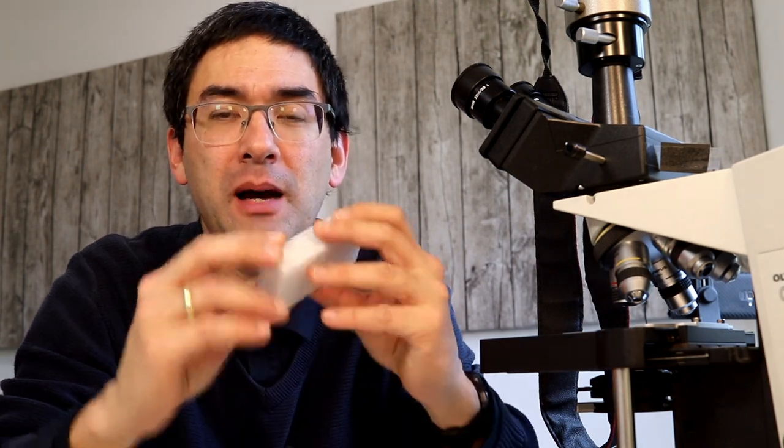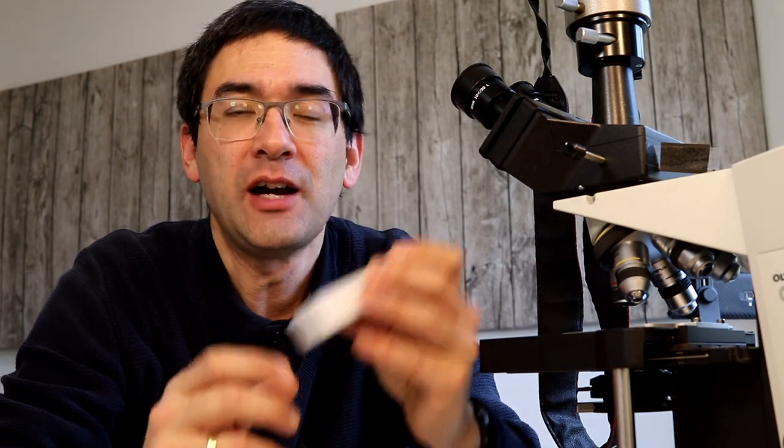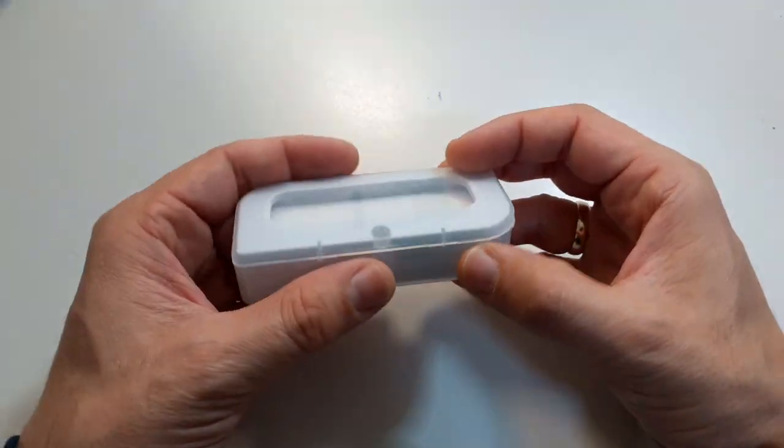And then in the second part of this video, I'm going to show you also how to make so-called scale bars. Now, just see that my camera is tilting over a little bit. Okay, here we go again. So a micrometer slide allows you to make measurements under the microscope. And what I'm going to do now is I'm going to first unpack it and I'm going to show you what's inside.